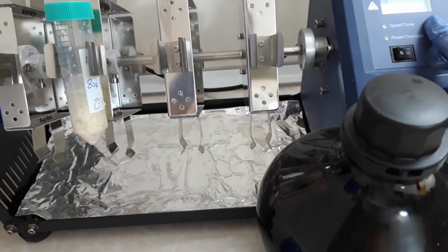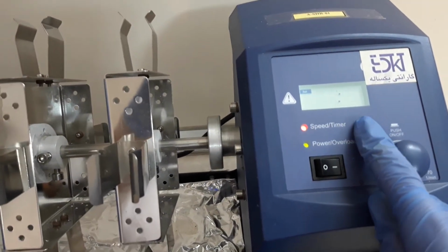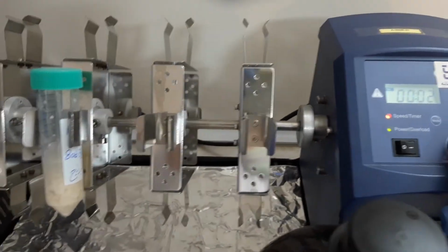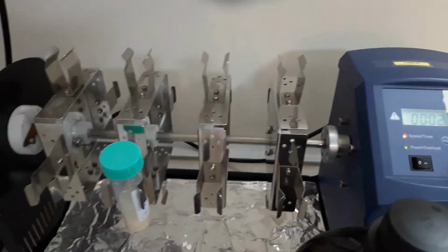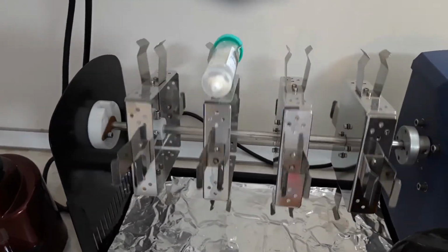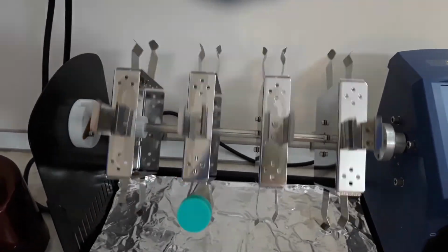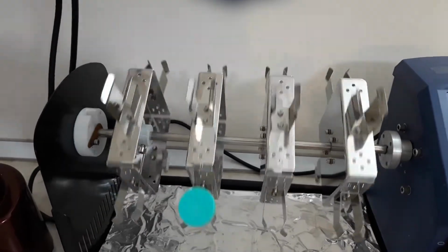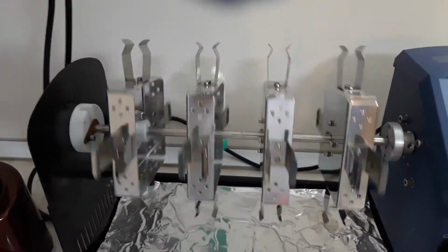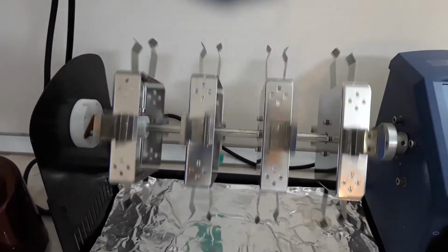Set the time and the ramp, and you can start it. After 2 minutes, we will take out this Falcon tube and go to another step.